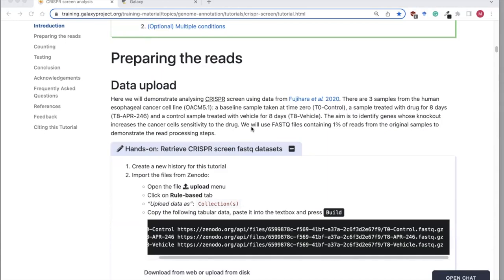We will use FASTQ files containing 1% of reads from the original data to demonstrate the read processing steps.